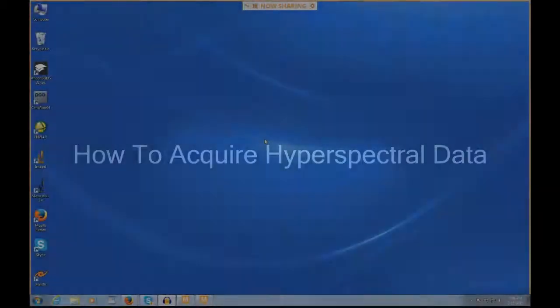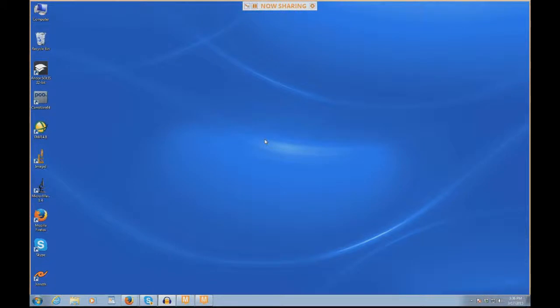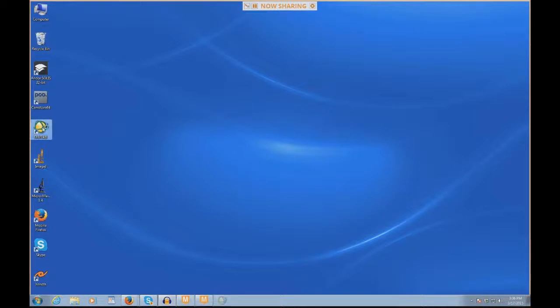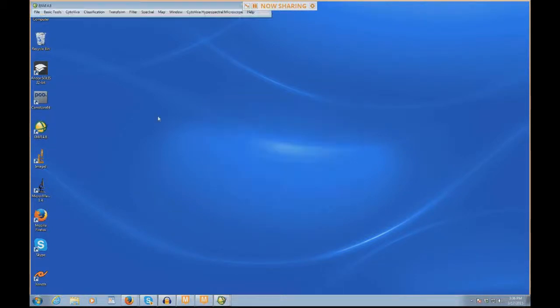Hello, welcome to the CiteAviva webinar on how to acquire hyperspectral data. To begin acquiring hyperspectral data, we use the Envy 4.8 software. By clicking on the Envy 4.8 icon on the desktop, we open up the Envy software.